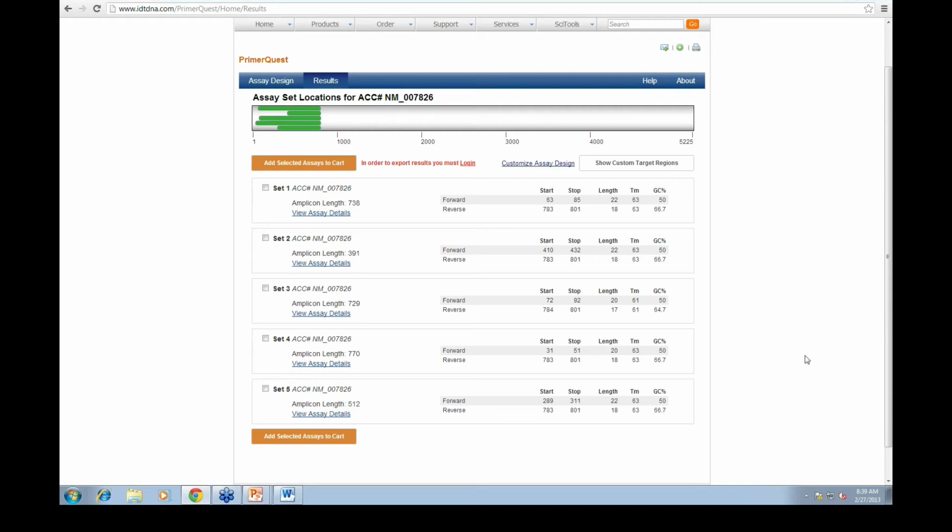So usually what we do in those cases is we'll design an assay that has a forward and reverse primer, and then it would have 2 probes. One probe would have a sequence for the wild type. The other probe would have the sequence of the mutant or that single nucleotide polymorphism sequence. And at the position of that SNP, you would have an LNA base. Typically, the probes have about 3 to 6 LNA bases, so it's a little bit of a shorter probe.